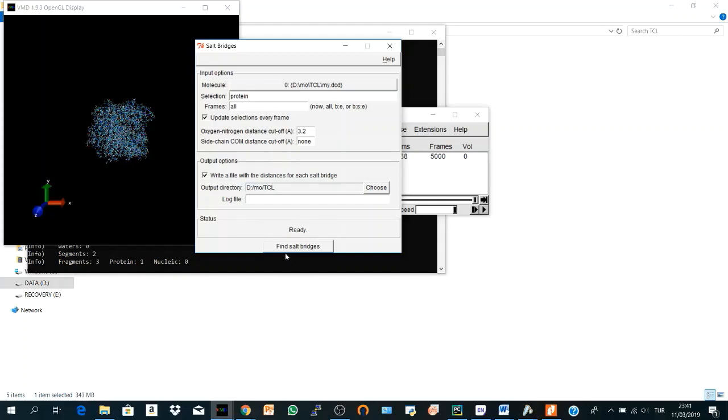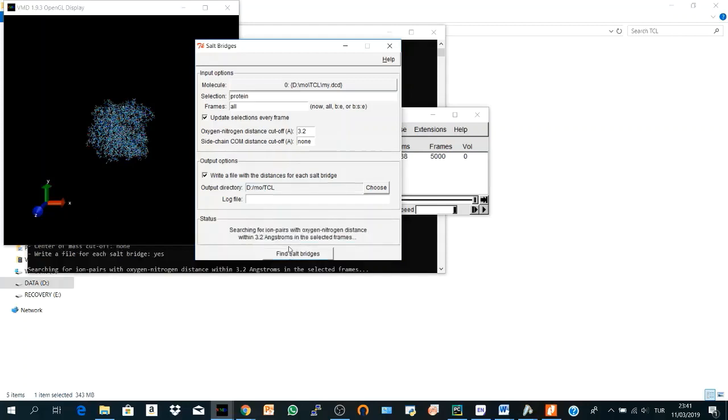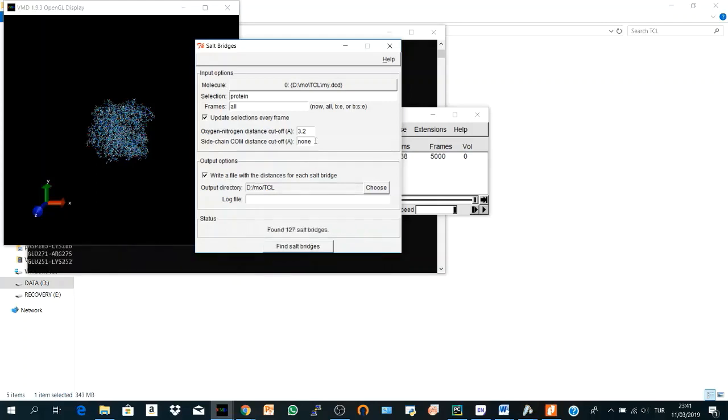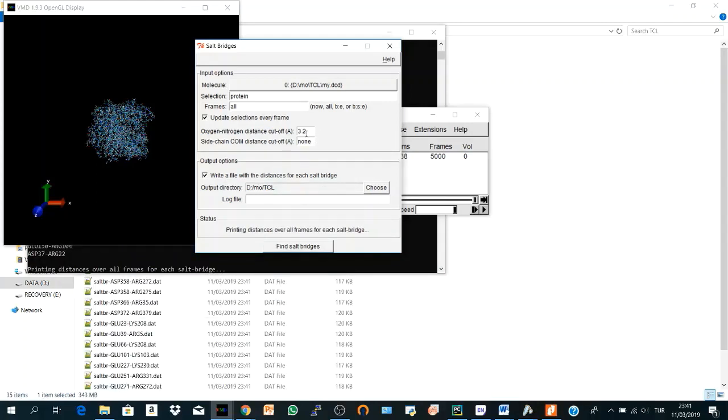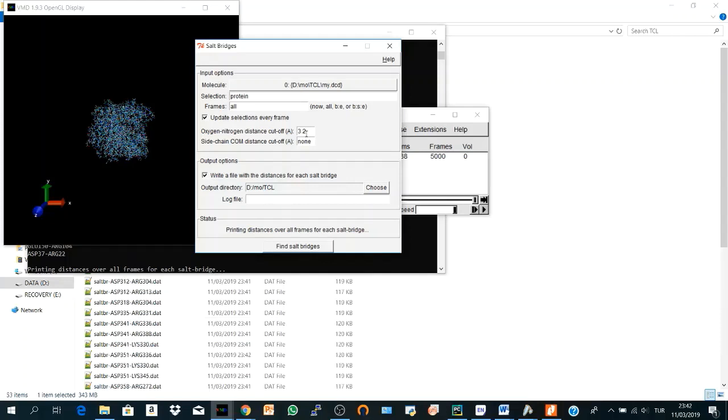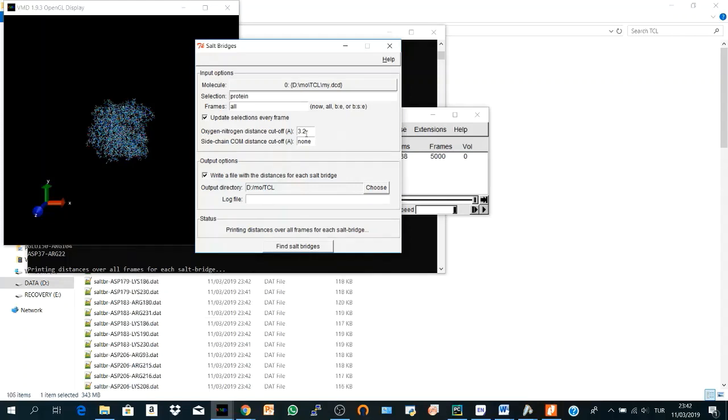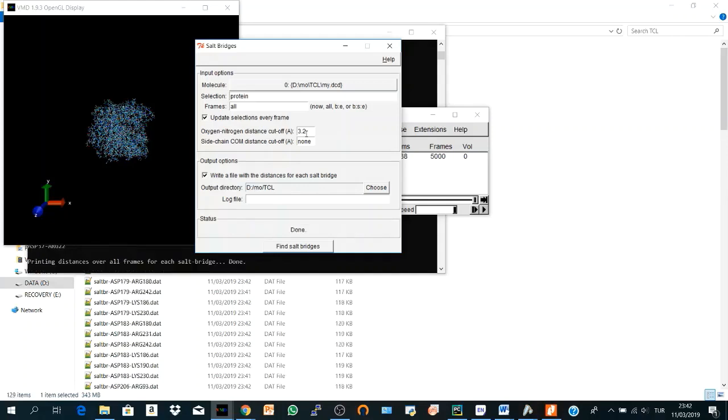So let's tell VMD to find the salt bridges. Now it's searching for ion pairs with oxygen and nitrogen distance within 3.2 angstrom in the selected frames. By the way you can change the cutoff distance. You can increase it or decrease it according to your purpose of calculation. It will take some time, a few minutes.